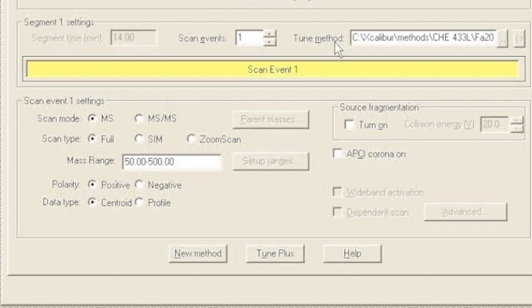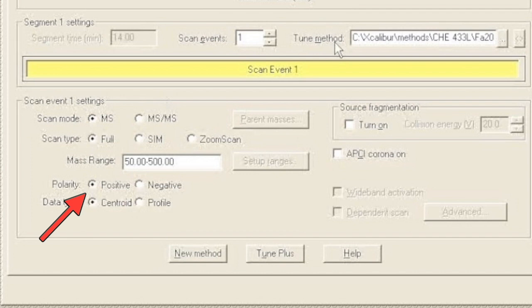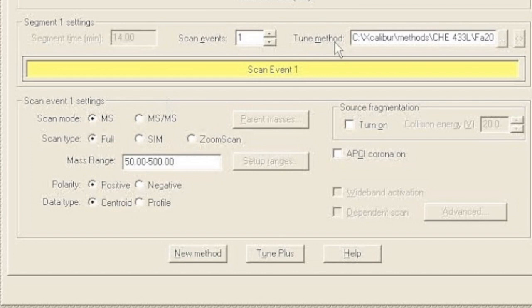Next we have to specify what kind of ions we're looking for, positive or negative. Most drugs are going to form positive ions really well. They're basic, so they will accept an H+ and become a positive ion and electrospray pretty easily. So for drugs we're going to stick with positive mode. One exception is THC, which you can see in positive mode but also does well in negative mode. Explosives and some other things you're often going to look at in negative mode.